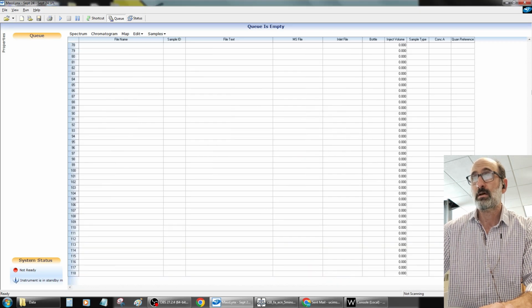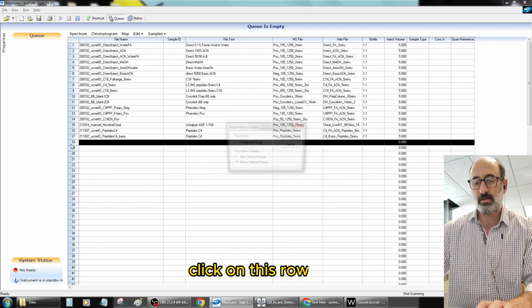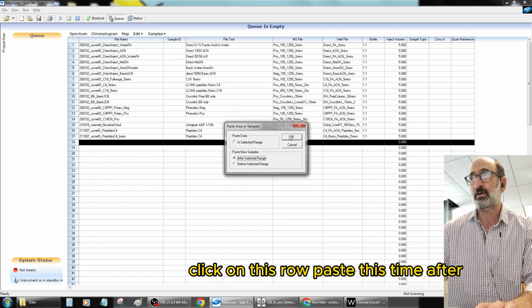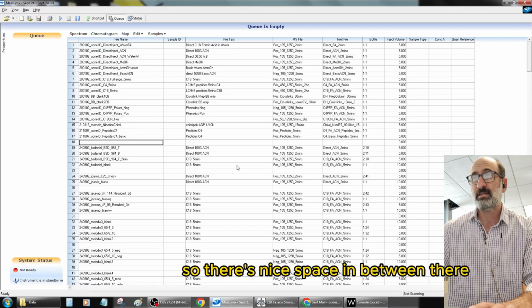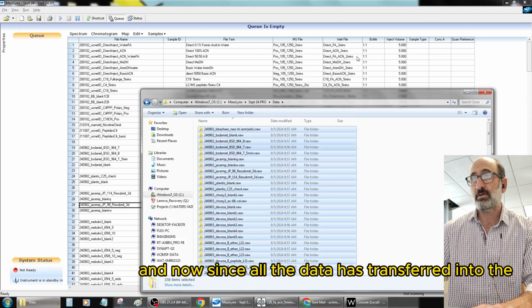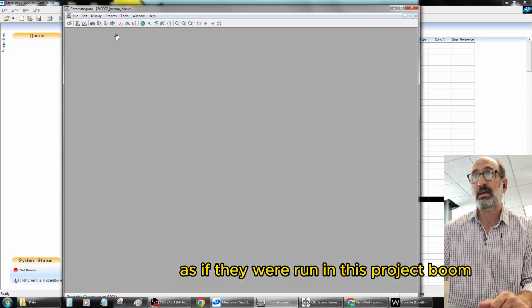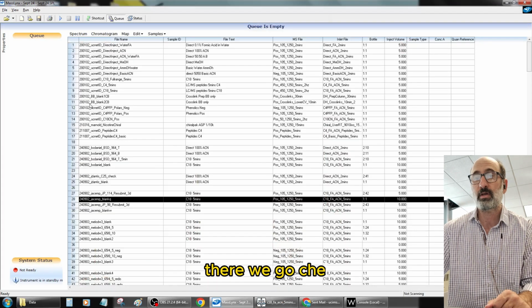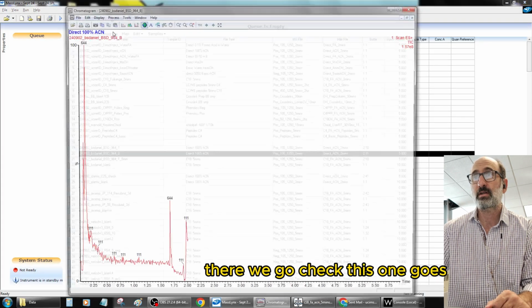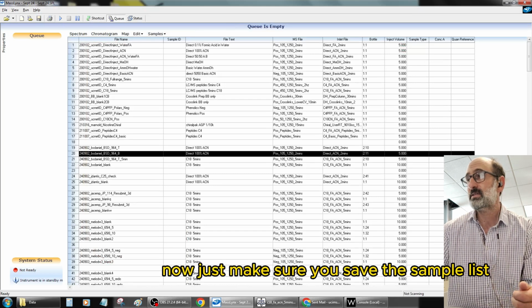Alright. So now in your new September project, we're going to come back up to the top here, click on this row, paste, this time after. So it leaves a nice space in between there. And now since all the data has transferred into the data folder here, we should be able to open these up as if they were run in this project. Boom, there we go. Check this one, there we go. So everything's here. Now just make sure you save the sample list.